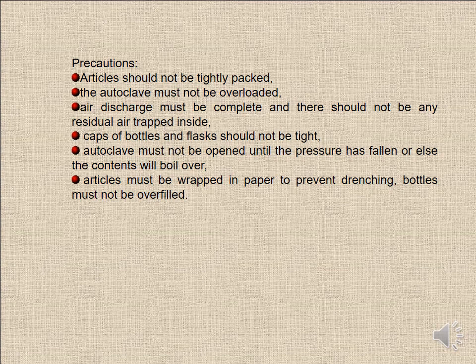The autoclave must not be opened until the pressure has fallen, or the contents will boil over. Articles must be wrapped in paper to prevent drenching. Bottles must not be overfilled.